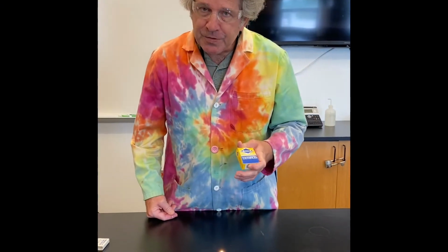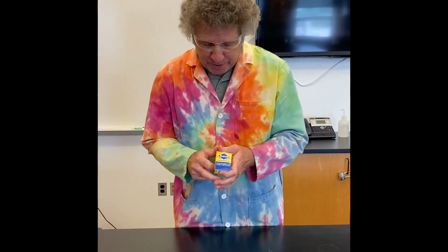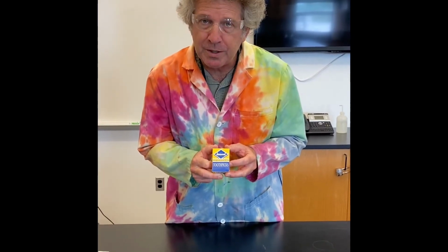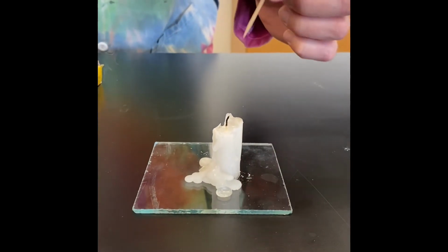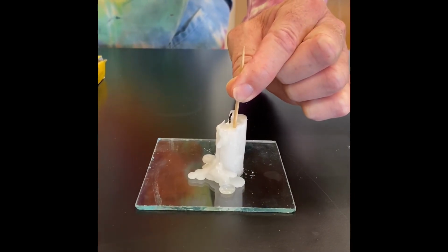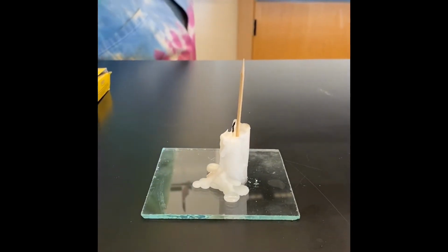Okay, in the first step of the lab, we examined the candle, and part of the candle was the wick, which is made out of string. Is it possible the wick could be made out of something else, like say wood? Why don't we try a toothpick? So I have a toothpick here, and I'm going to blow the candle out and insert this toothpick next to the wick into the candle. And why don't we light that and see if we could use a toothpick as a wick instead of string.